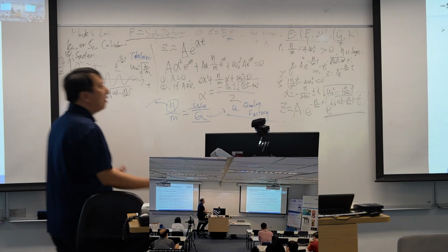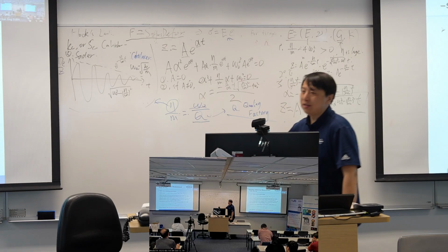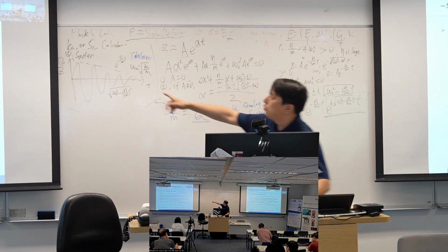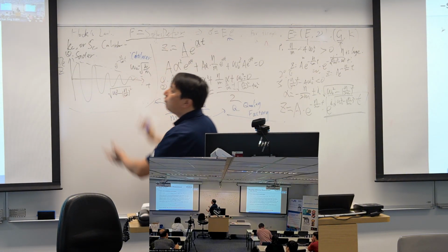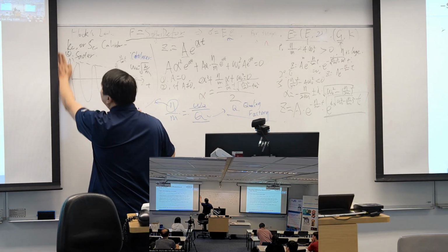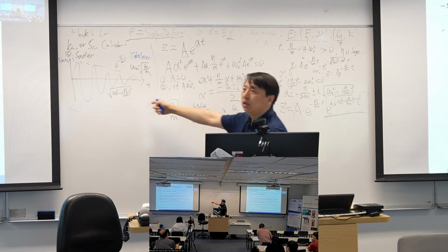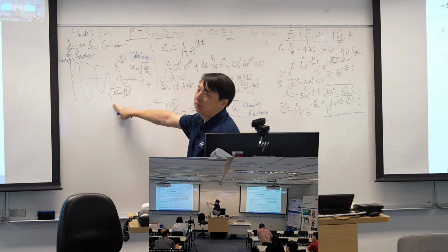So our AFM job now is to measure the resonance frequency and the quality factor. How are we doing this? We are using our AFM to monitor the vertical change against the time. We will get this kind of damped oscillation curve.